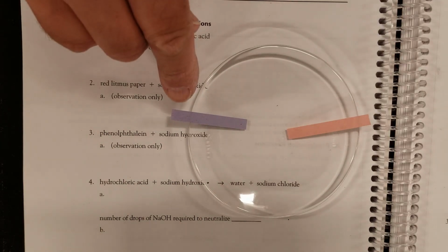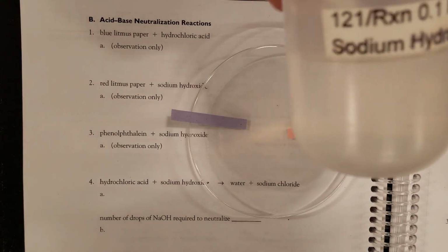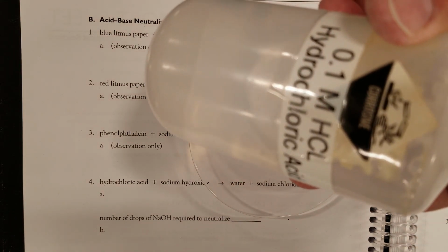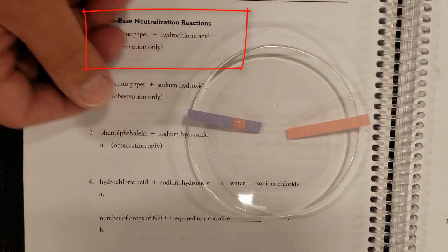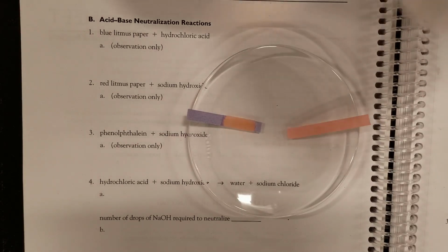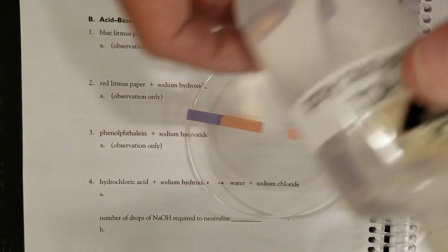So we have a piece of blue litmus paper here. We're going to add a drop of hydrochloric acid to it. And what you see is the blue litmus turns red. So if you're using litmus paper and your chemical makes it turn red, that chemical happens to be an acid.